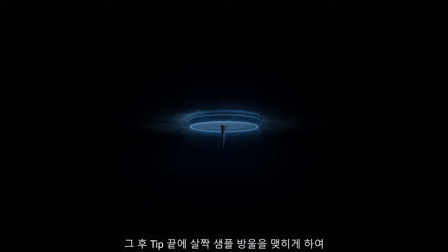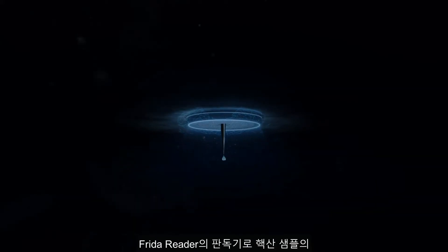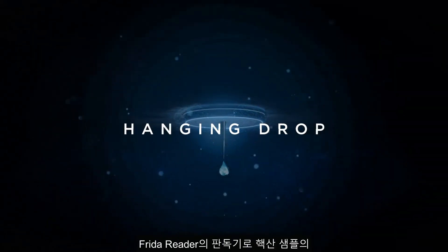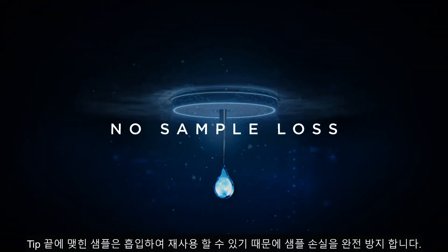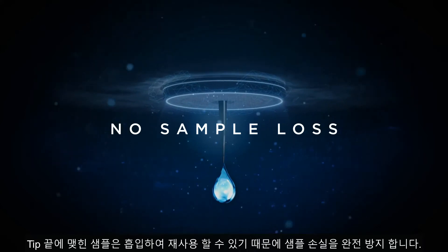The FridaReader then measures the concentration and purity of a nucleic acid sample in the hanging drop at the end of a standard disposable tip. This unique technology completely avoids sample loss as the drop can be reused.